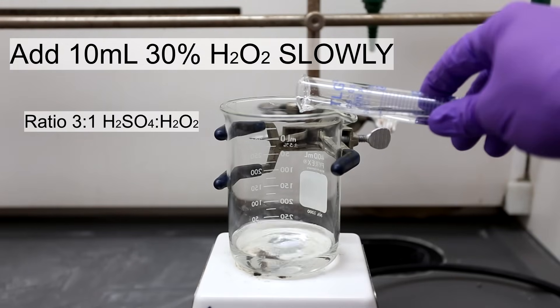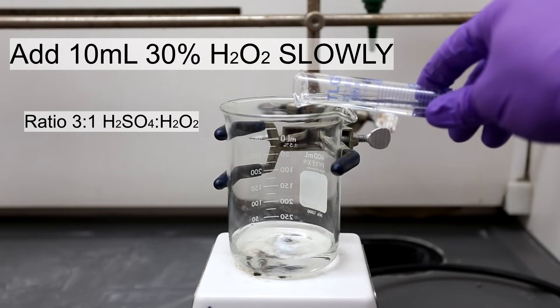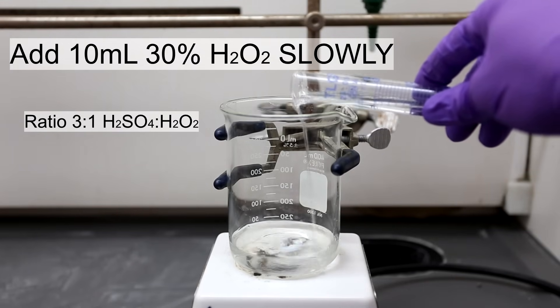Next, with strong stirring, 10 milliliters of 30% hydrogen peroxide was added very slowly.